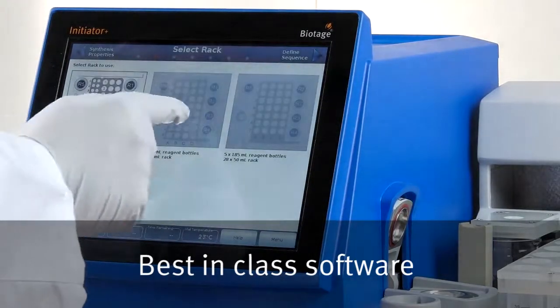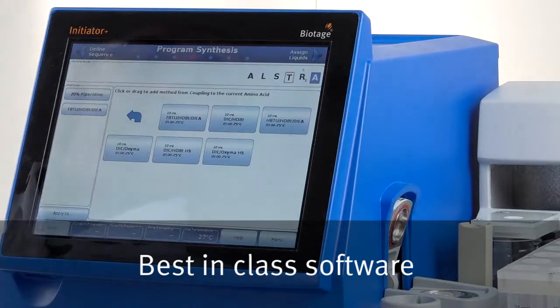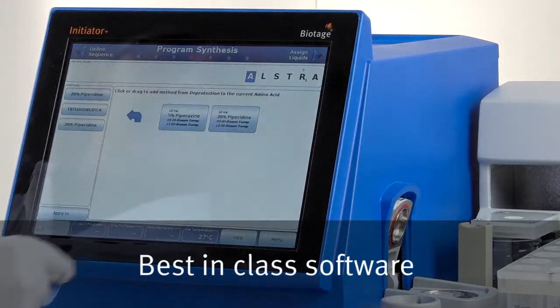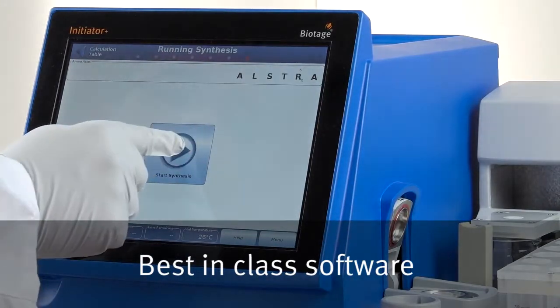The most flexible, intuitive and user-friendly software available and the built-in wizard makes programming a synthesis sequence effortless and enables a synthesis to be started quickly.